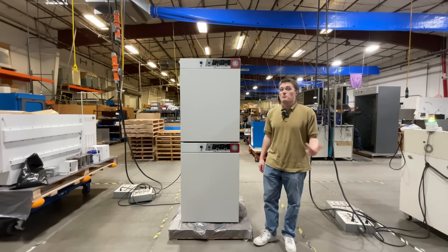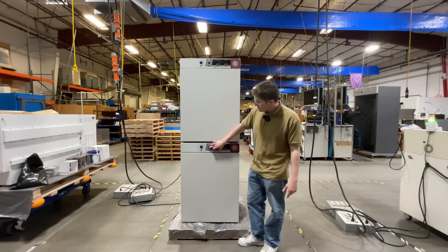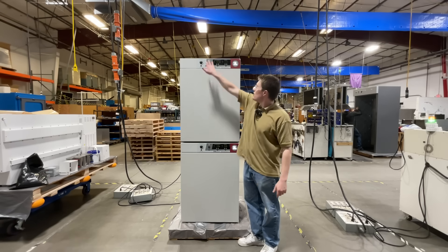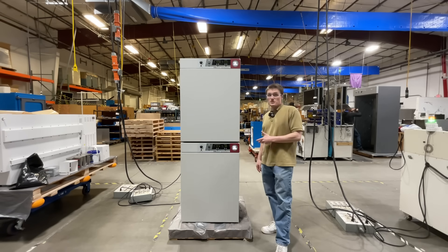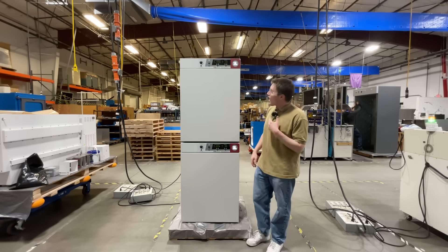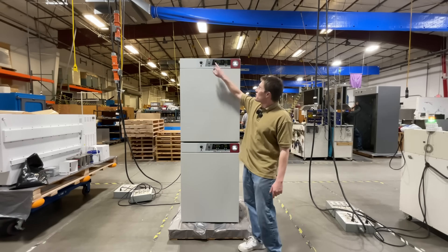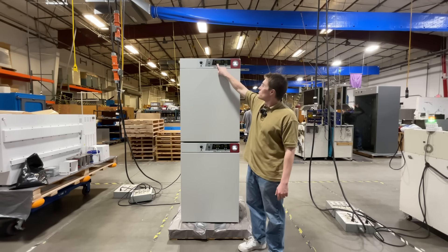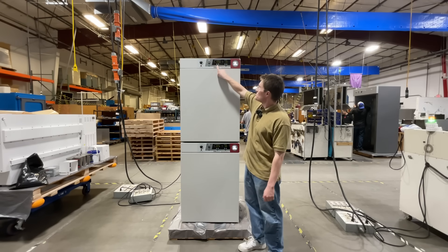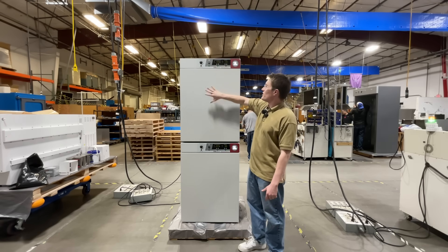Once you've connected the unit to a properly grounded electrical outlet, we are ready to turn the unit on. For details on electrical connections, clearances, and other installation information, please reference your user manual. After powering on, the control panel becomes available. First, you will see the temperature screen. This allows the user to both read, adjust, and monitor temperature while in operation.